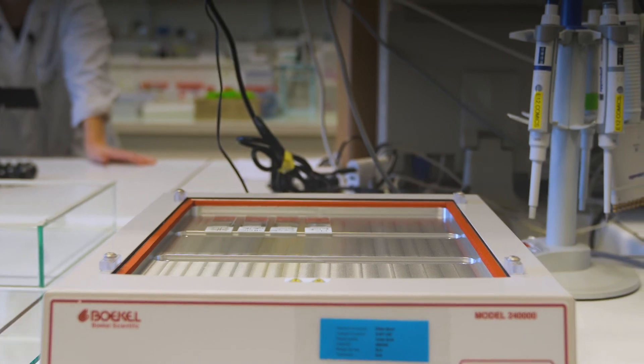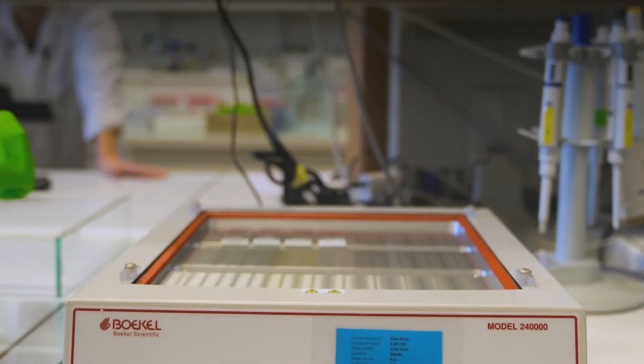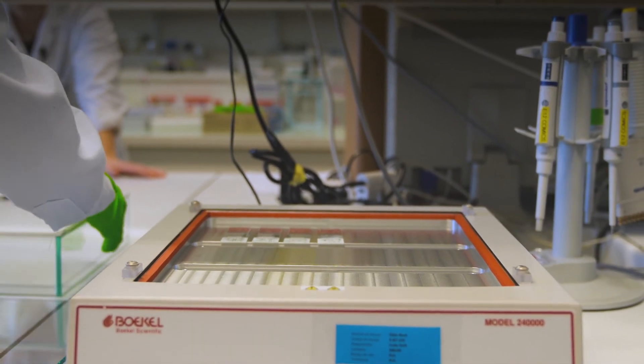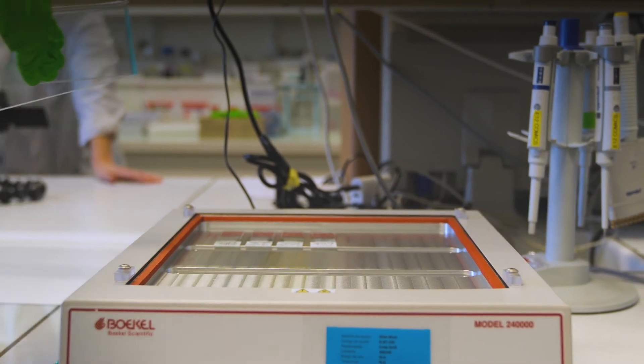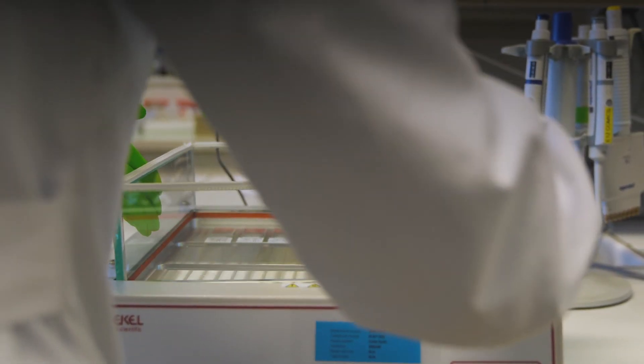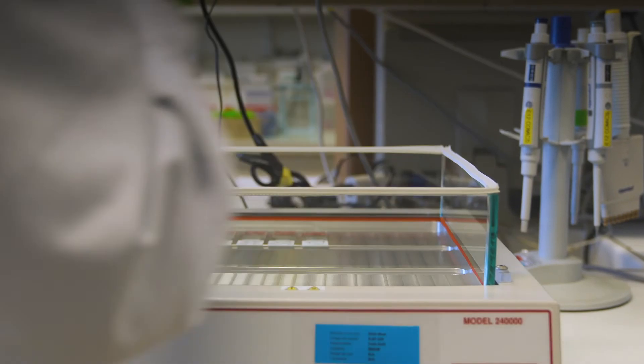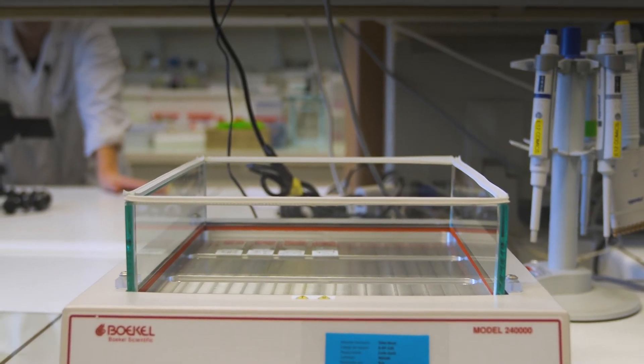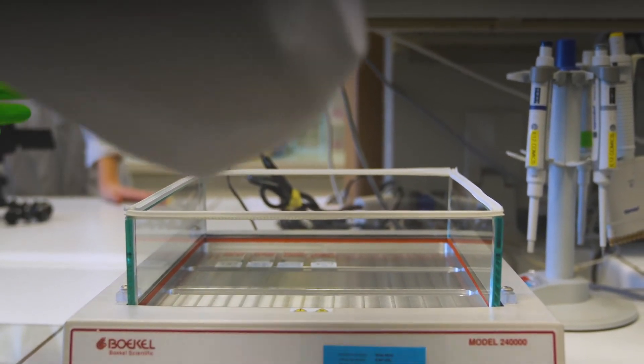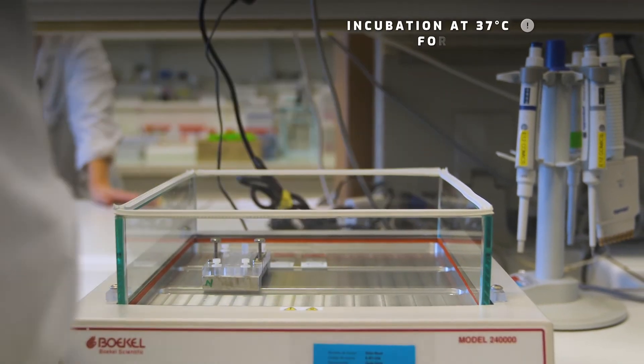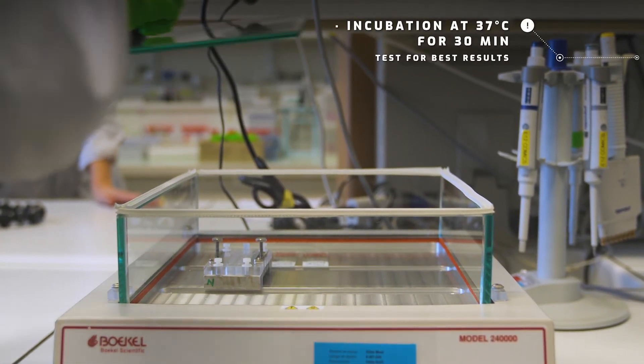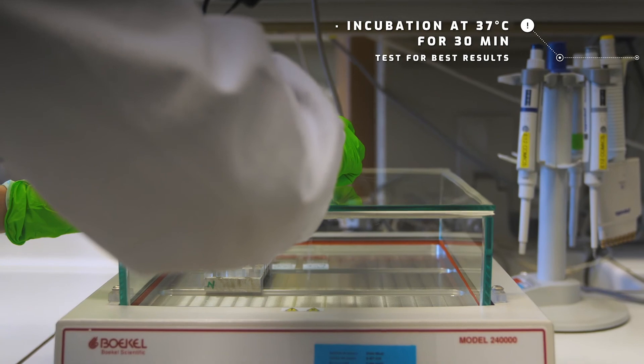If you want to work with 12 gel systems, what you can do is make an intersection, like a way to increase the height. Then you can put the 12 gel incubation chamber also in there and incubate everything at 37 degrees.